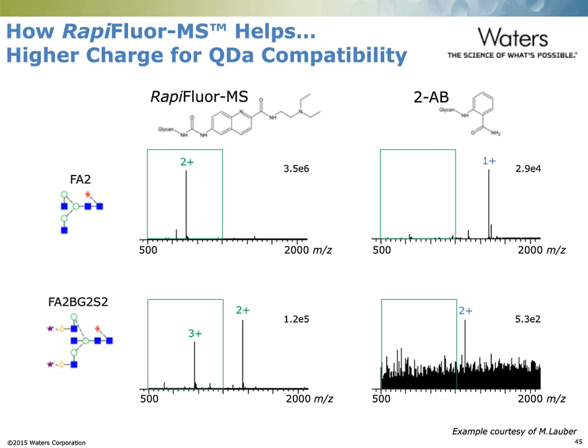And in addition, the MS response is 1 to 2 orders of magnitude lower than we would see compared to RapiFluor-MS. So if we look at the RapiFluor-MS side, we see not only do we have charge states that fit well within the mass range of the QDa, but in addition, the signal to noise and the relative intensity of each of those structures is sufficient to enable us to monitor each of those structures.